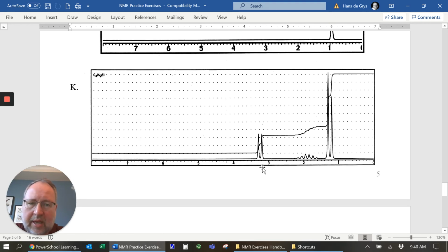This one is very interesting. Like, what's going on here? If you look to see if we're saturated or not, for halogens you actually have to add them in. So a halogen counts like a hydrogen. So C4H10 is the equivalent here. That would suggest saturated. This is a very characteristic structure.